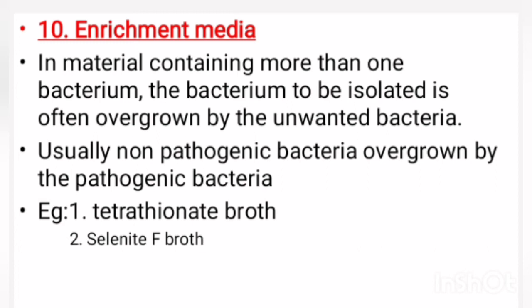In such cases, a substance that has a stimulatory effect on pathogenic bacteria and inhibitory effect on non-pathogenic bacteria is added to the media. So that will promote the growth of the wanted bacteria and suppress the growth of the unwanted bacteria. Another example for the enrichment media is tetrathionate broth that inhibits the growth of coliforms and allows the growth of Salmonella typhi and Salmonella paratyphi.